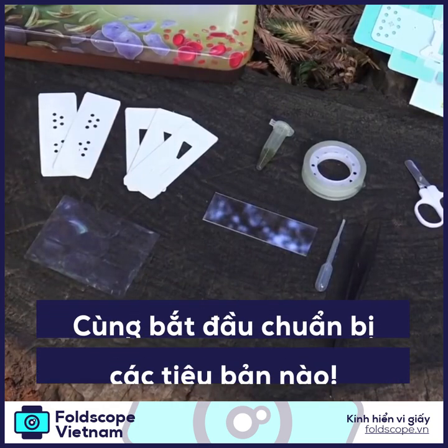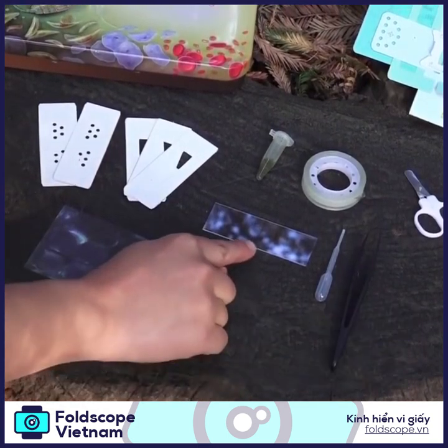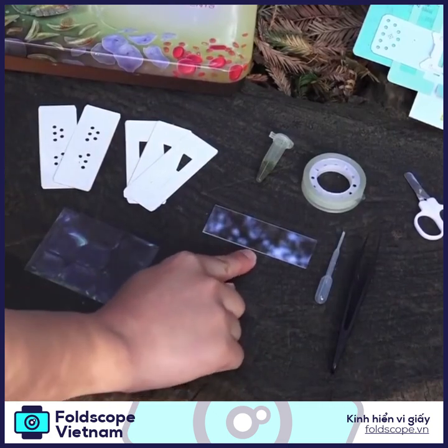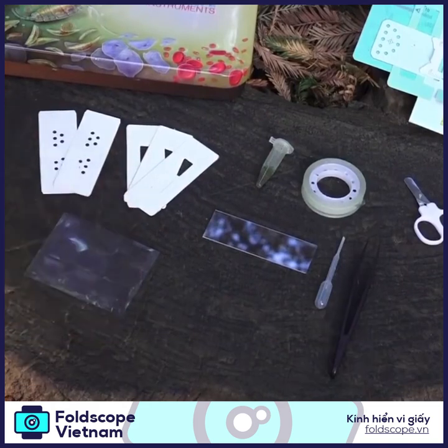Let's practice preparing your own slides. First I'm going to show you how to prepare one with a glass slide and then I will also show you how to prepare your paper slides.